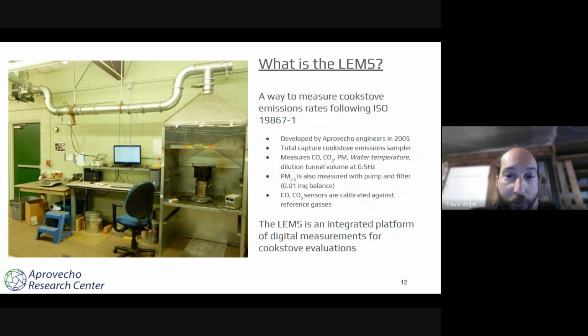The PM 2.5 is also collected via pump and a filter setup. So we're able to collect a sample of particulate matter and weigh that. By combining the temperature inside of the duct and the flow rate inside the duct as well, we're able to convert the gas emissions into a mass rate.